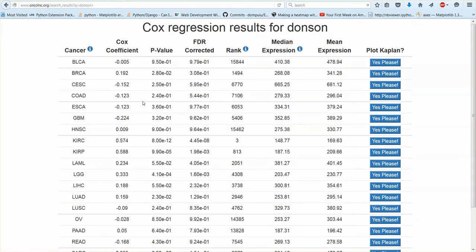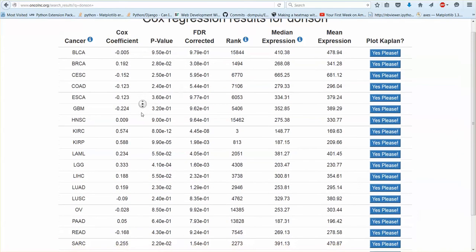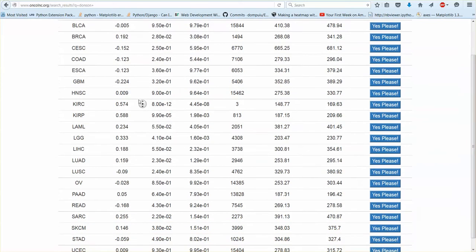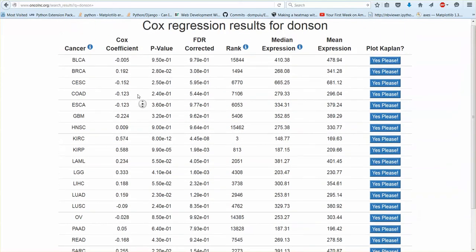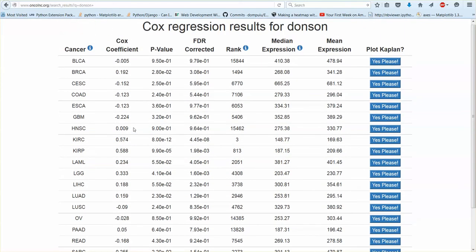Basically you'll want to look at a couple columns. So the Cox coefficient tells you the contribution to the hazard ratio, which sounds complicated, but all it's saying is that a positive coefficient increases the hazard ratio and the larger the number the more so it does.